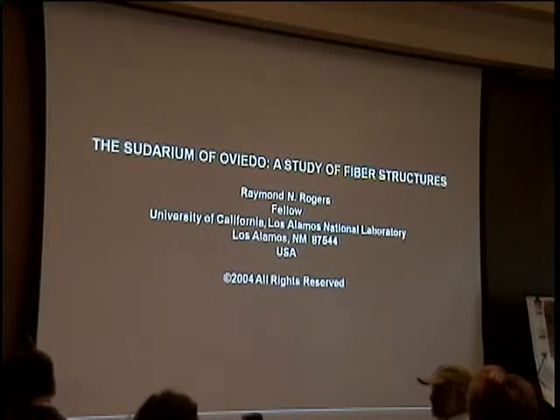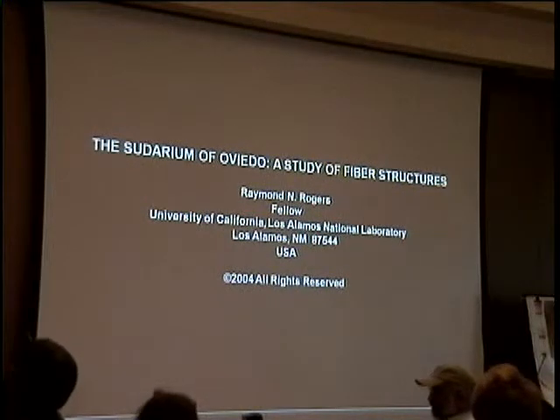the Elder. Flax fibers are mostly crystalline cellulose, and the crystals have a fibrillar structure. The fibers are birefringent between crossed polarizers. However, the birefringence changes depending on the past history of the material. Perfect new flax fibers show extinction. The segments between growth nodes are perfectly black at two angles as the microscope stage is rotated. Strained or irradiated fibers show zones of birefringence at other angles.